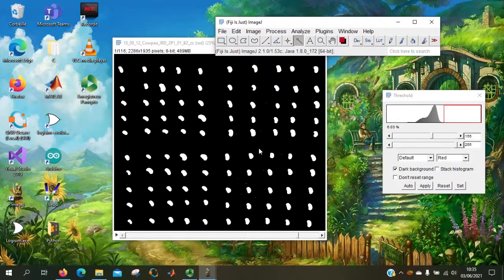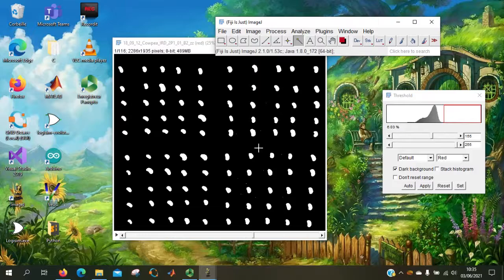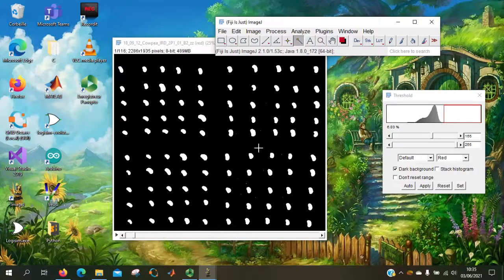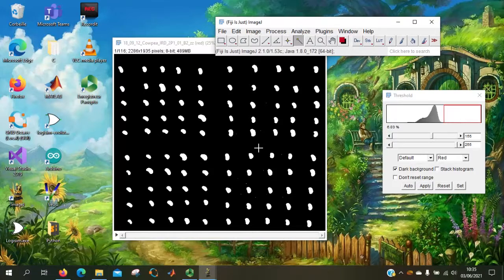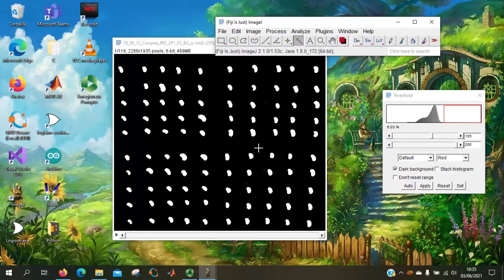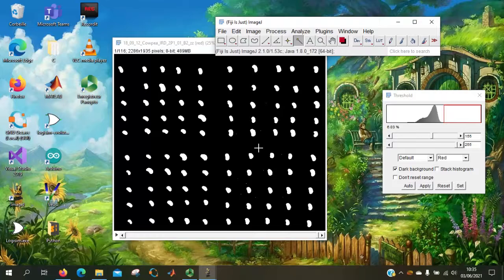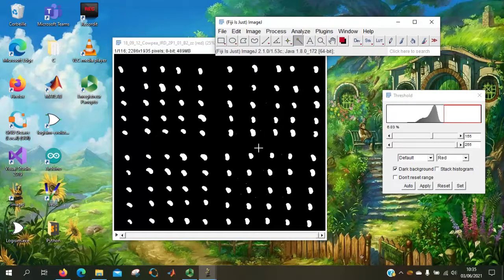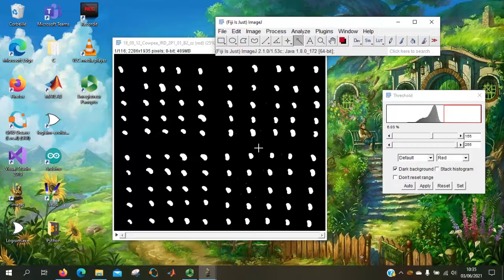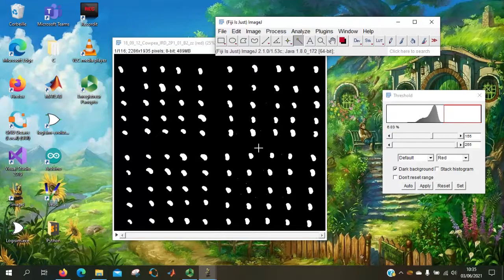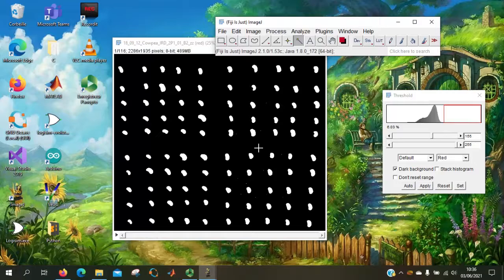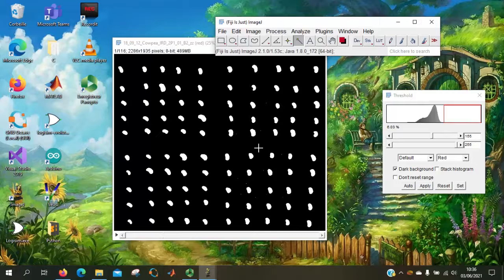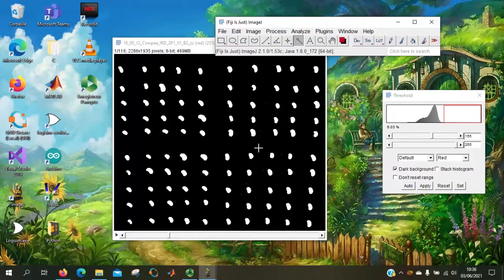The macro has all the position of the seeds at the start of the stack, and it will check for every image of the stack, the position of the seed. And with the delta position between two images, it will set if a seed is germinating or not.